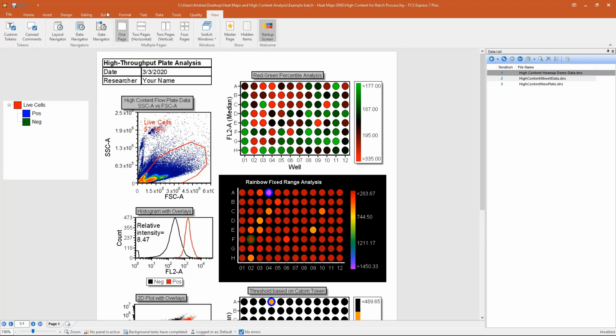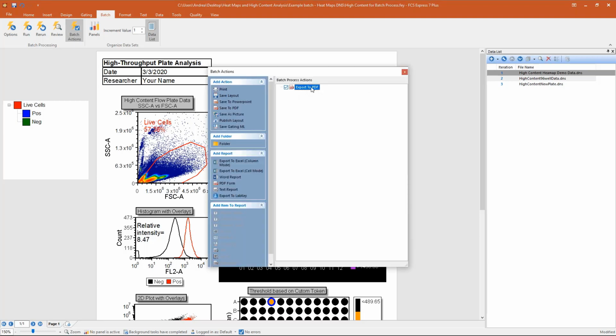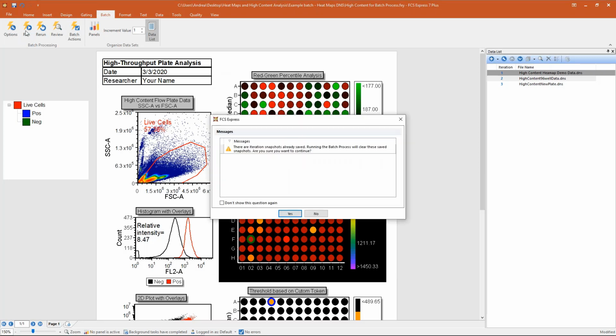And I want to conclude by running the batch processing. We have a full webinar on batch processing, so if you are interested, just have a look at that webinar. In this case, I'm going to do something very easy. I'm just exporting to PDF, but we have a bunch of different exporting options like PowerPoint. We can save, we can print, we can save to Excel, and so on. Once you are ready, you can just click on run.